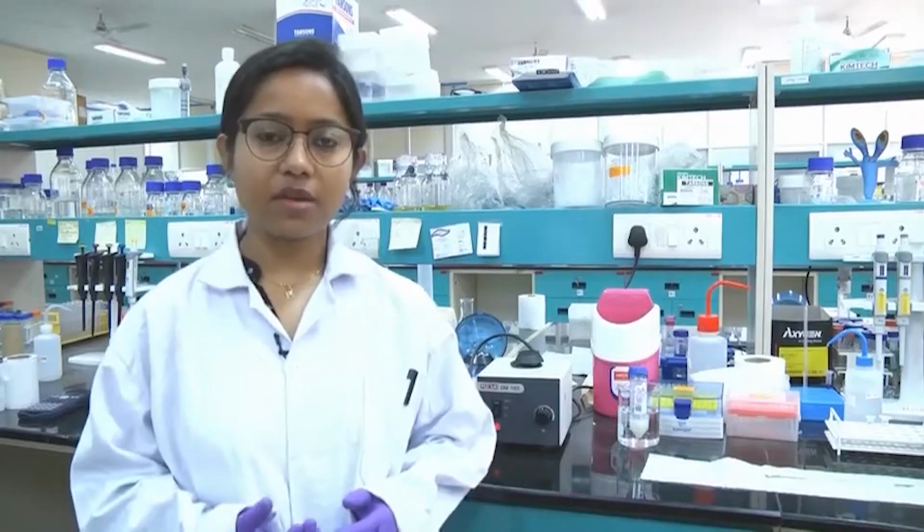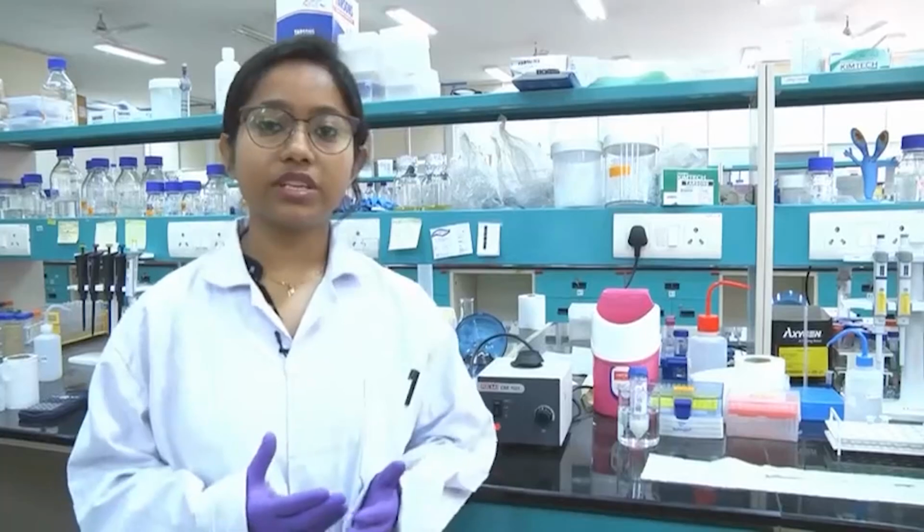There is no hard and fast single technique for isolating a particular protein. Depending on the protein you need to modify the protocol a little bit, but mostly the basic principle will be the same. First we need to have the source of that particular protein.